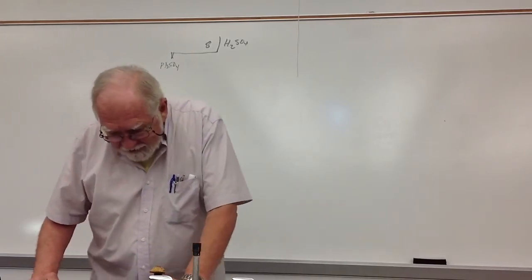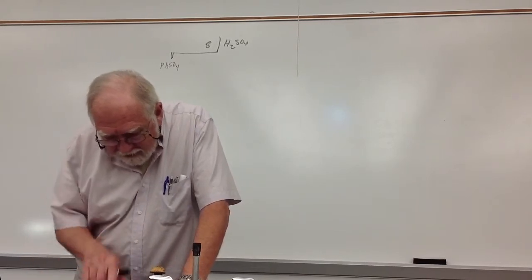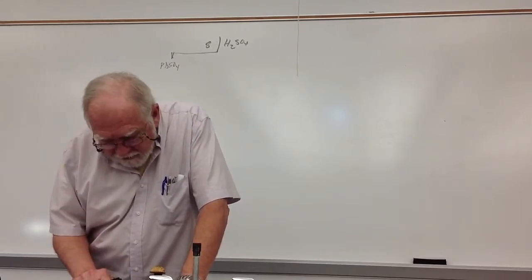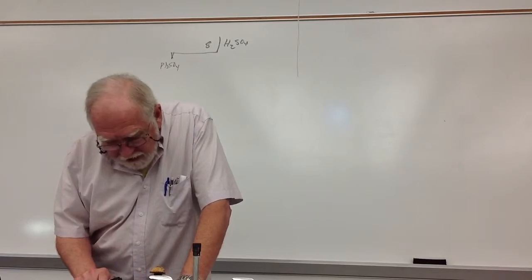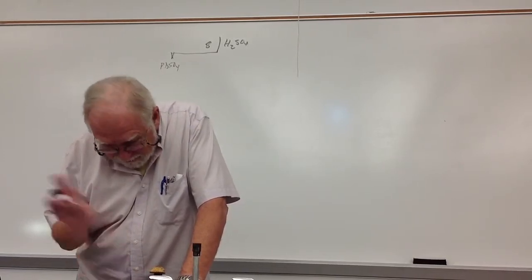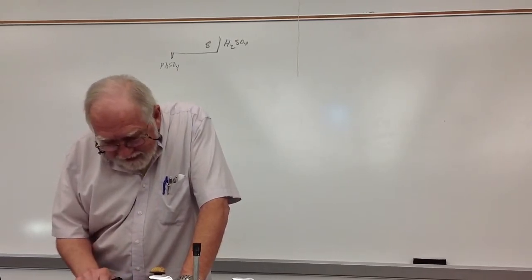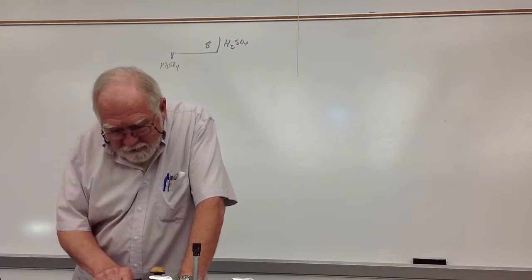But at the top of it, it says continuing on down here, white precipitate, I'm about 3/4 of the way down the paragraph. Fine suspension shows the presence of lead. Centrifuge, decant the supernatant, decant until the supernatant is clear, you always do that at a centrifuge. Decant into the test tube and save for procedure 9.